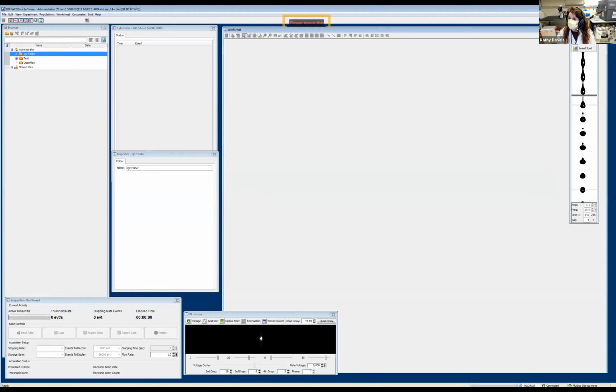When we train people, it's 5 hands-on sessions of at least 2.5 to 3 hours, right? And that's just for our facility. Some facilities do even more than that. So we're giving you the overview today, but there's a lot more involved in the sorting. We're just giving you the practical considerations.